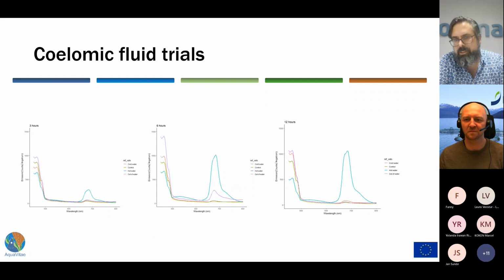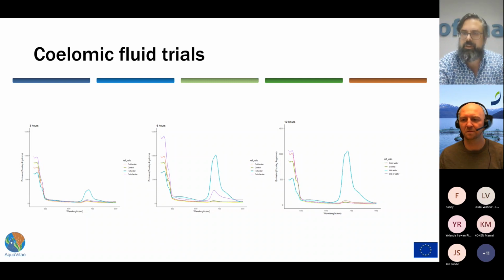But what's interesting too is that in the green zone, from about 495 to 590, give or take, the green, as time goes on, actually collapses in relation to the amount of red fluorescence produced by the animals.